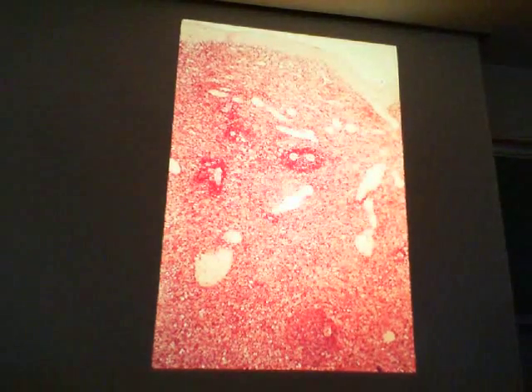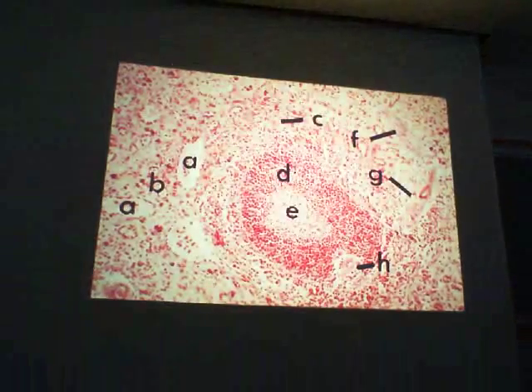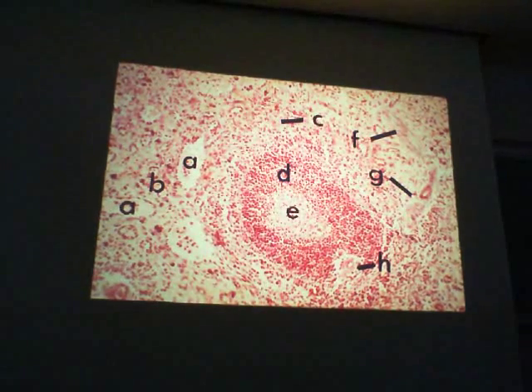And so right here, what subdivision of the spleen do we have? White pulp, and that makes this stuff out there red pulp. Okay, and so we have that out there. What is that? Capsule. We've got a trabeculum coming down, more or less like fingers. There's white pulp right there, and if we take a closer look at that, what is this entire structure that we see right there?